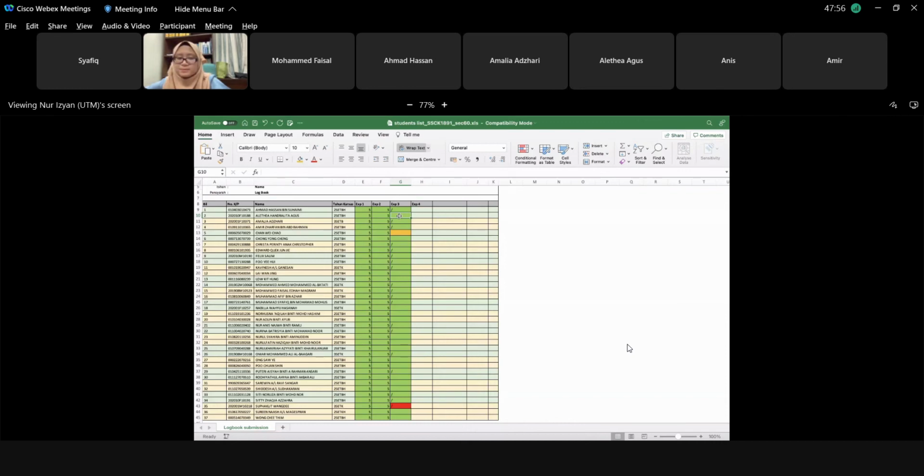Hello, Alitia. Sorry? Face shield. Yeah. Face shield. Okay, good. Face shield, one. Okay, Chong Yong Cheng. And other PPE needed? Glove. Glove, okay. Face shield done. Glove done.